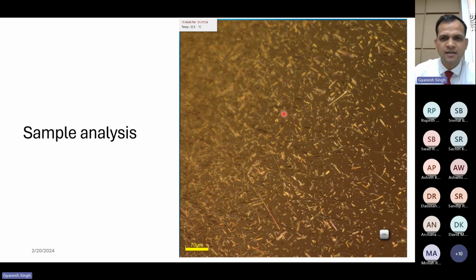Now, this is basically a 40 minutes video. Of course, we won't play all of it, but 2, 3 points we'll talk about very specifically. First, just see this entire image. On the top, we have a date stamp, time stamp, and a temperature stamp. And at the bottom, we have a micron marker. Now, this is an API sample.